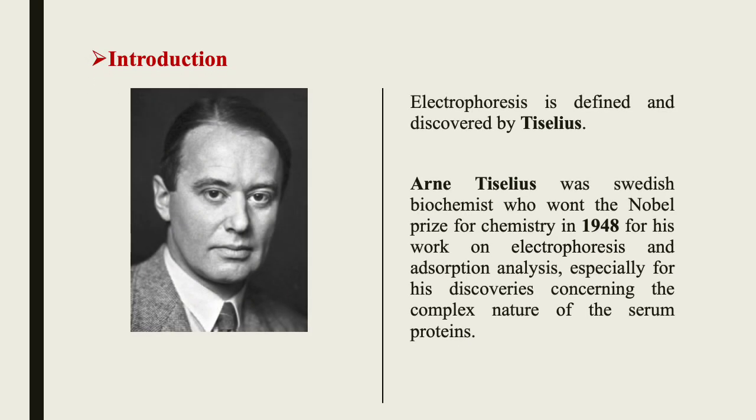Electrophoresis was defined and discovered by Arne Tiselius. Tiselius was a Swedish biochemist who won the Nobel Prize for chemistry in 1948 for his work on electrophoresis and adsorption analysis, especially for his discovery concerning the complex nature of the serum proteins. So he was the first Swedish biochemist who used this electrophoresis technique.